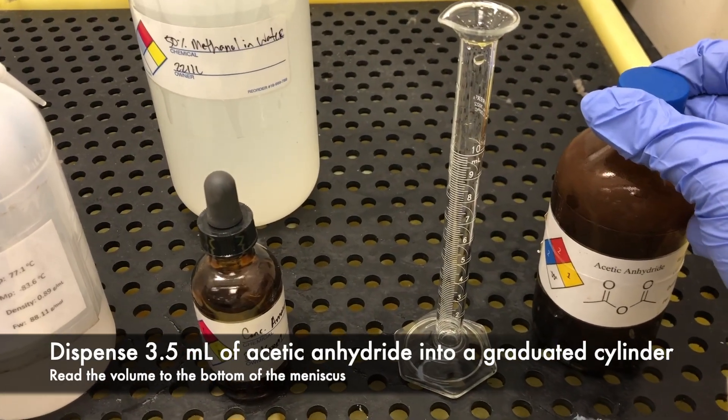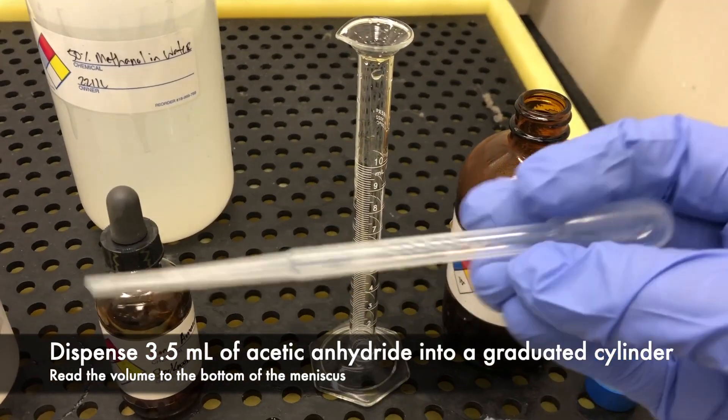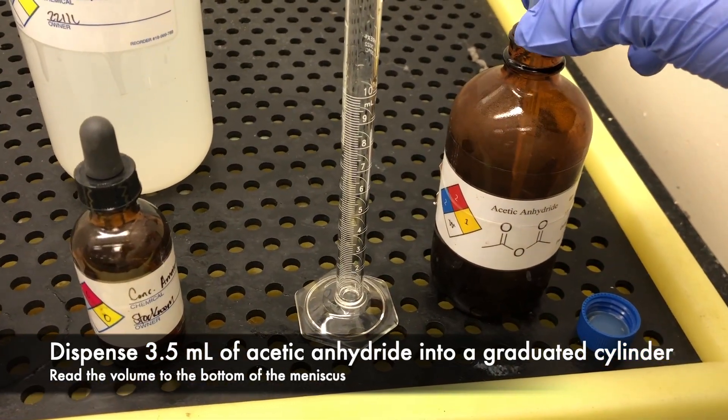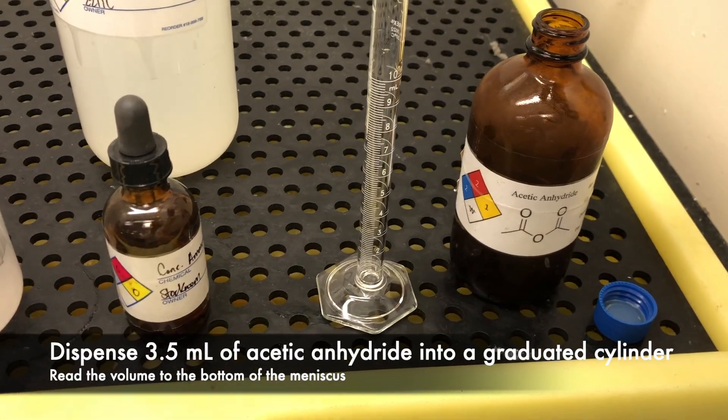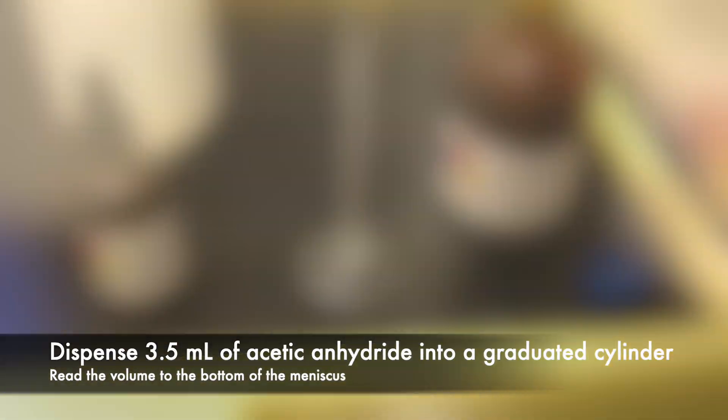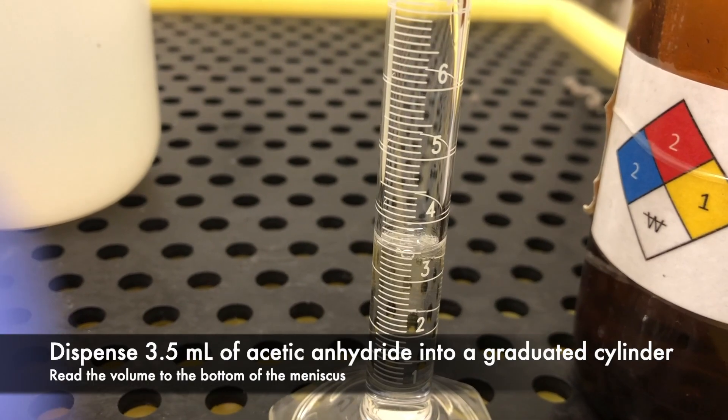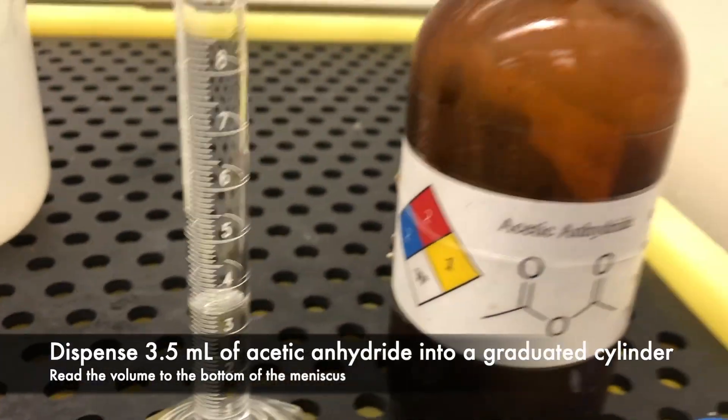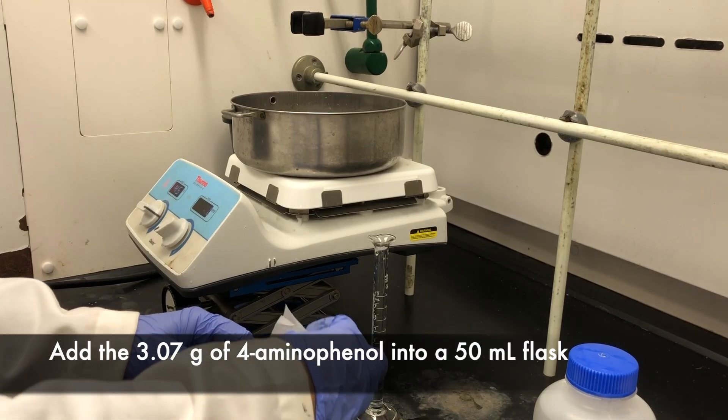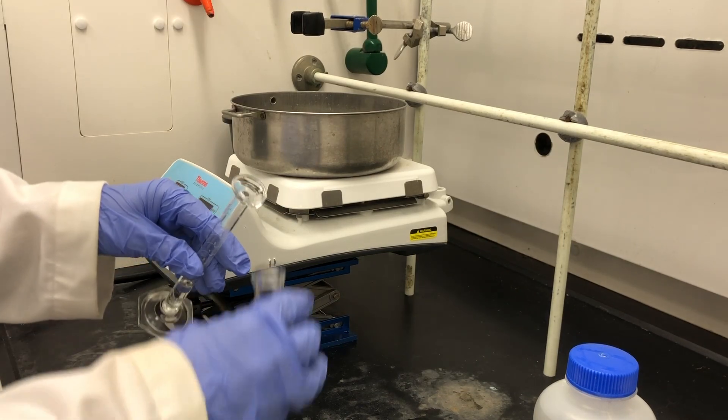The experiment calls for using acetic anhydride as one of our two reagents. I'm going to use a transfer pipette, a disposable transfer pipette, to measure out 3.5 milliliters of acetic anhydride. I'll go ahead and pour that in.